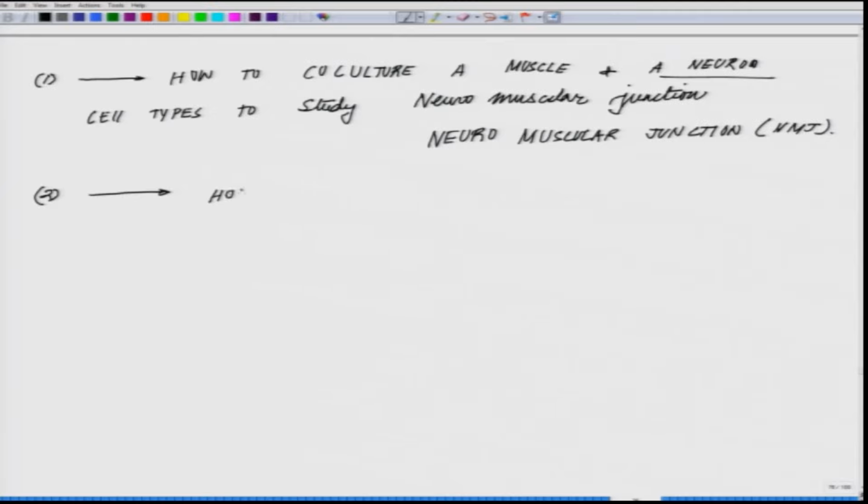how to integrate this system on a micro cantilever assembly.